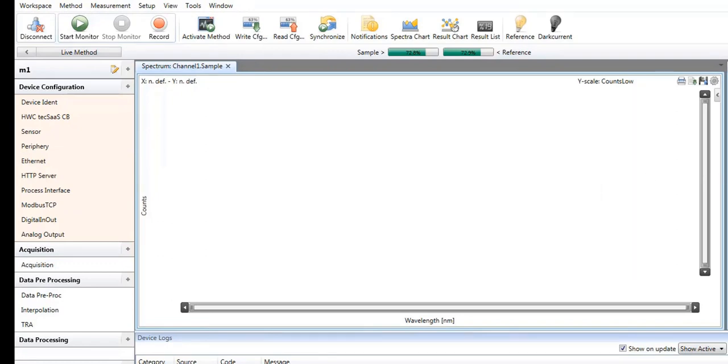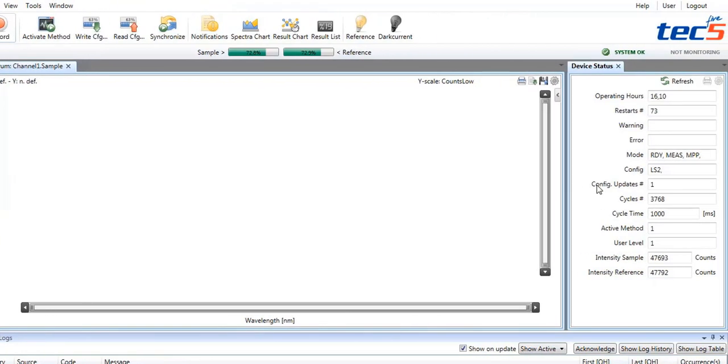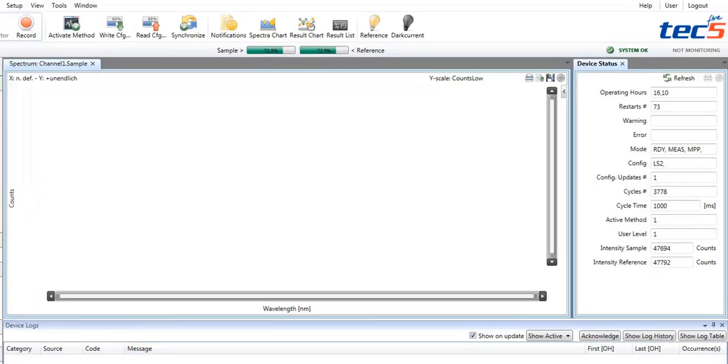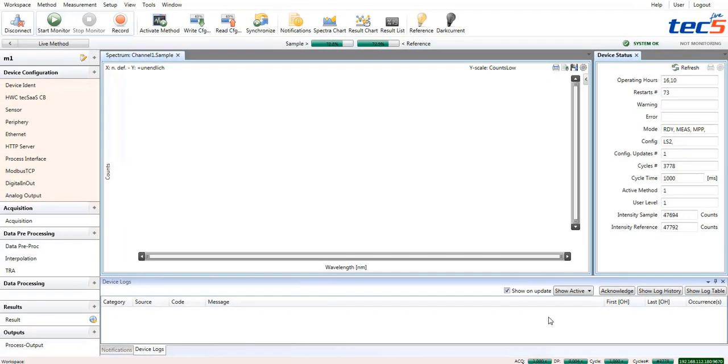At the right edge, there is some status information retrieved from the system. And at the bottom, error messages or warnings may be displayed depending on the software settings.